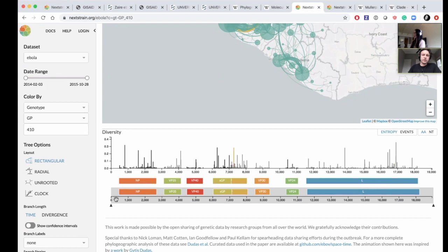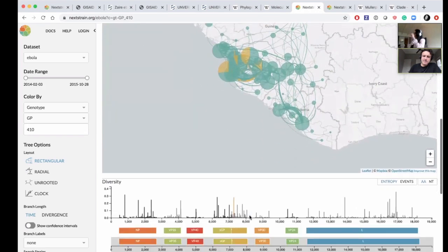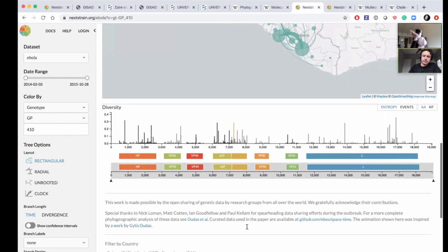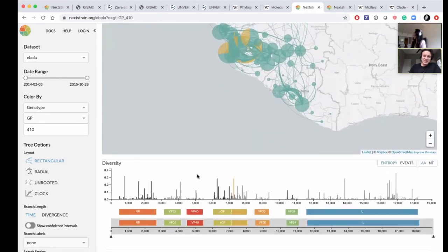Got it. So you might watch different sites with varying levels of interest, is my understanding. I see. And I noticed that those spanned the parts where the bars exist. So that's really interesting also. Right. Okay, so I think I now understand the diversity part.